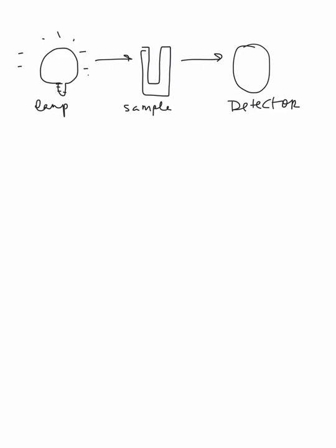So in this video, we're going to talk about how a UV visible spectrophotometer records absorbance measurements. In the UV visible spectrophotometer, there is a lamp which releases a light, I sub naught, which hits the sample. Now a certain percentage of this light, represented by I with no subscripts, then hits the detector. The UV visible spectrophotometer uses the relationship between the light that hits the sample and the light that actually passes through the sample and then hits the detector to record an absorbance.